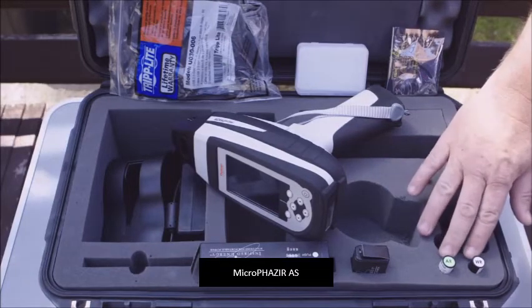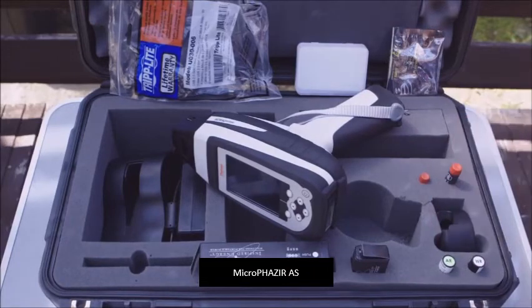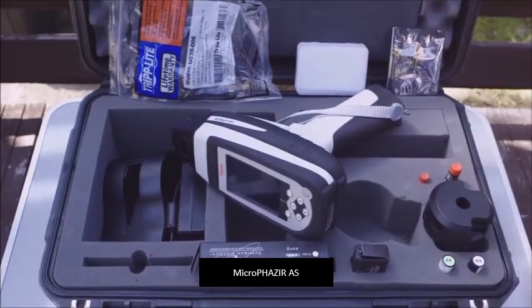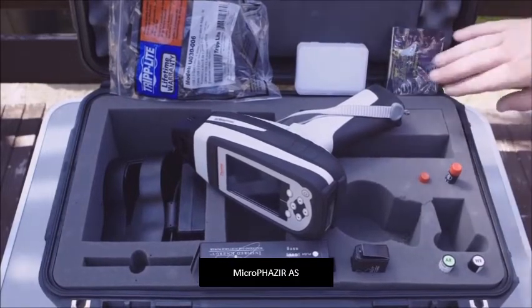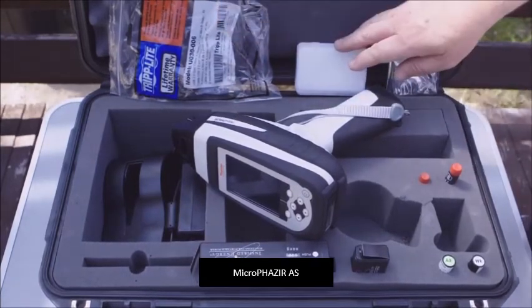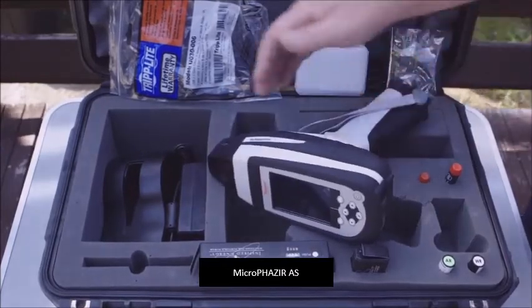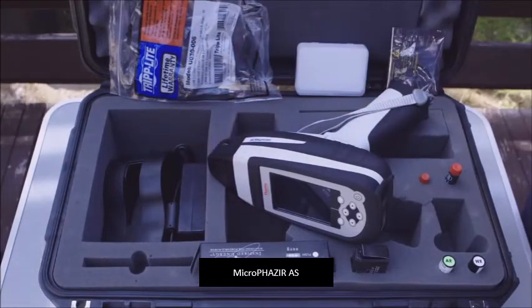We have the asbestos reference and the white reference samples and the holder, which are used during the calibration process. We also have several tools used to change the bulb, the spare bulb itself, a USB cable, a USB drive with software for downloading data, and the battery charger and power pack system used to charge the batteries.